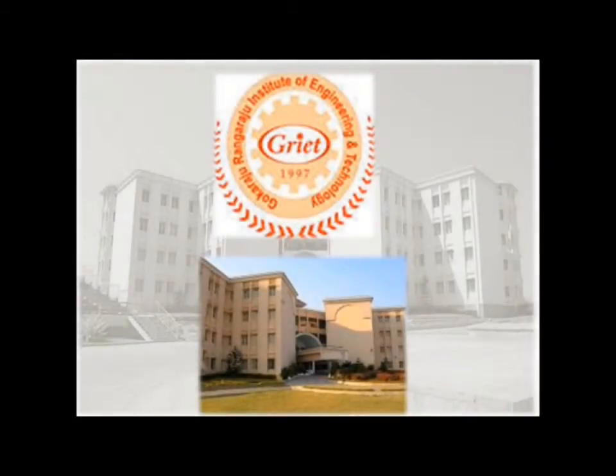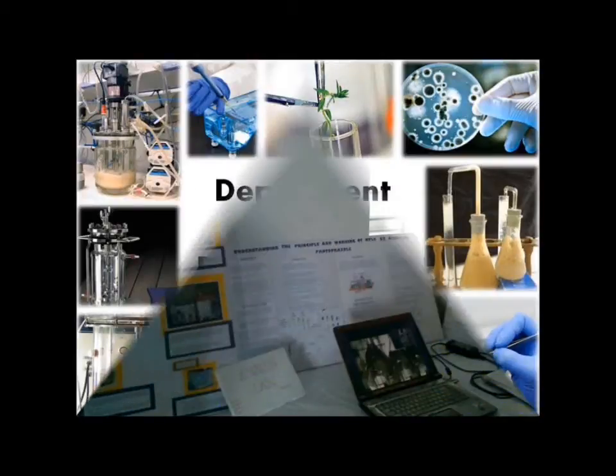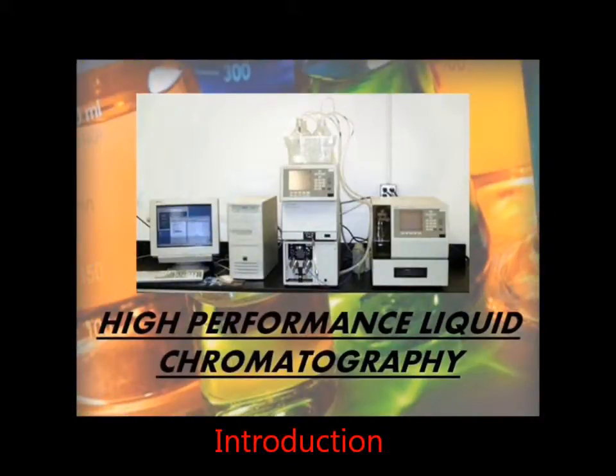We, the students of GRIT studying 4th year of BTech in Biotechnology, have done our project on understanding the principle and working of HPLC by assaying the drug pantoprazole. HPLC stands for High Performance Liquid Chromatography.